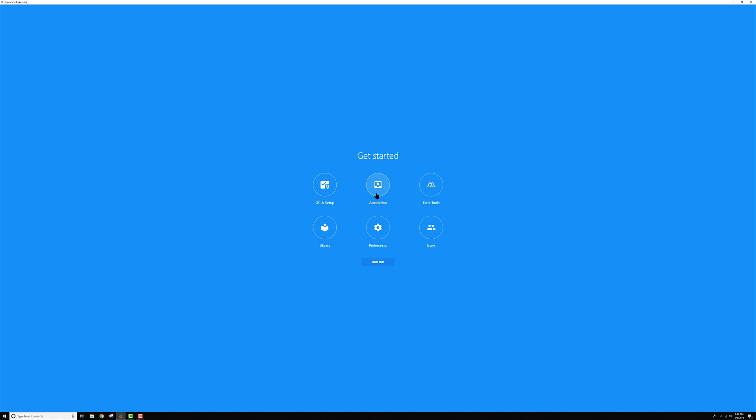Then there's the acquisition page. This is where you're going to come to set up your experiments, run all of your tubes, look at your data in the worksheets. This is where you'll spend the majority of your time in our software.